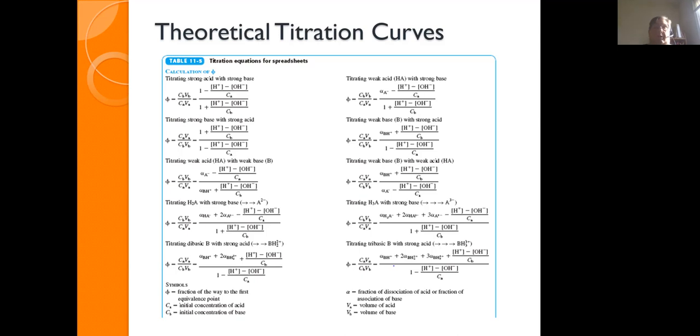If when you collect the data, it is not indicating the equivalence points, meaning you get NaN, which is not a number, again, that doesn't matter. All that matters is that the graph looks correct. So if the graph has one equivalence point, and it's supposed to have one equivalence point, you're good. If it has two equivalence points and you're supposed to have two equivalence points, you're fine. It does not need to be accurate, and it does not need to calculate the equivalence points for you. You can do that very easily once you've done your derivative plots.